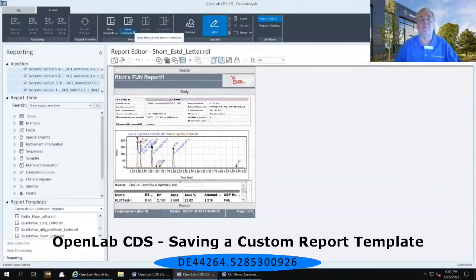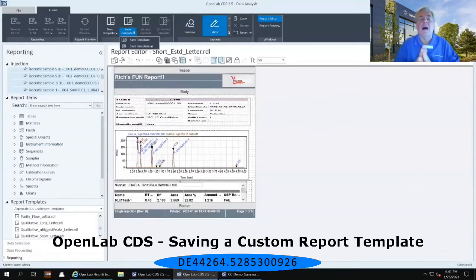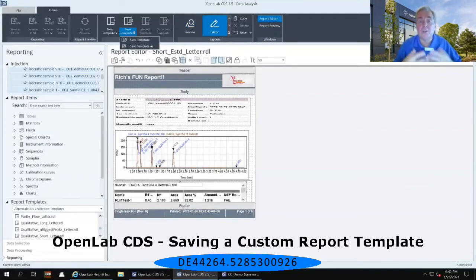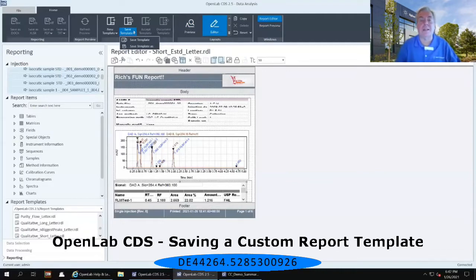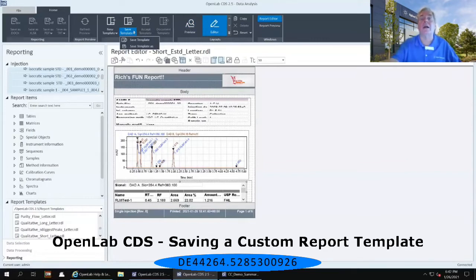There's a pull-down menu available there. It says Save Template or Save Template As. I am going to strongly suggest you do not save over the templates that Agilent gives you out of the box, because there is no way to restore those templates without understanding what changes you've made and rolling back those changes. Instead, until you become very comfortable with what the templates are and what they give you, I strongly suggest you make your own templates and allow Agilent's templates to be your guide.